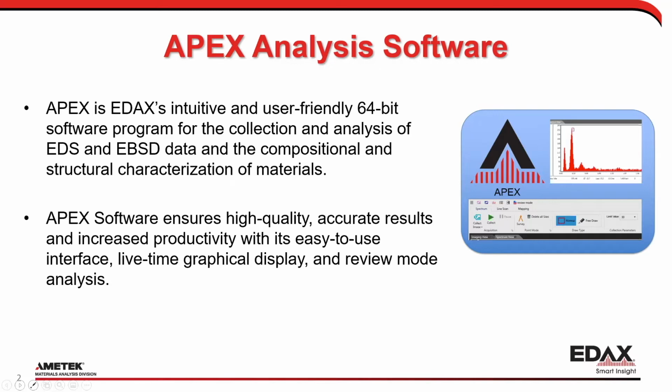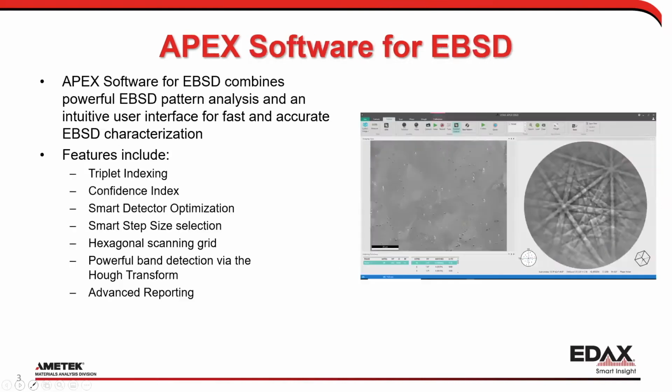So we use this as our data collection software for the analysis of your materials, and it does a good job. Of course, it's made to be highly productive and easy to use, and much more real-time feedback than Team could give you, including reviewing data at the same time. So Apex EBSD software was released to customers, I think, in October-ish. Don't hold me to that.